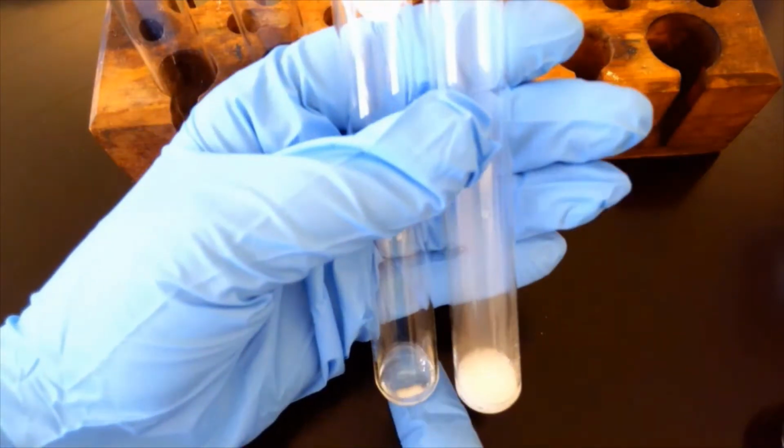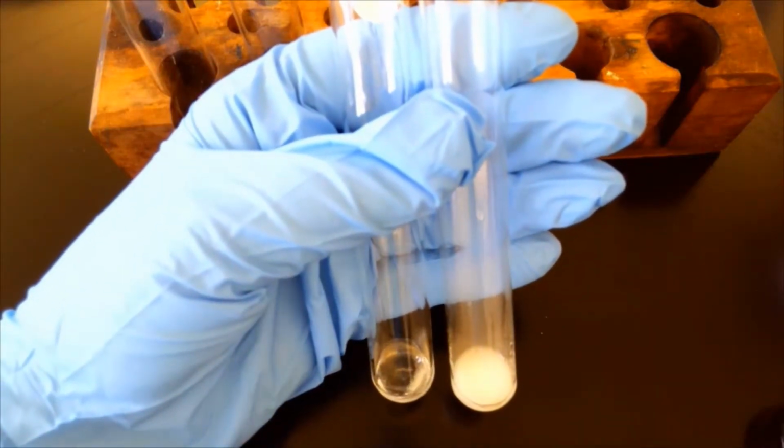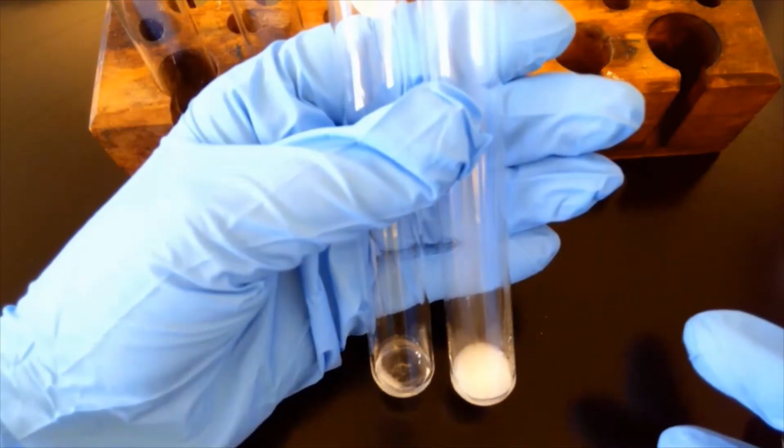Same with the acetic acid, not so much. I can keep my finger on here longer, but right now I can only, that actually hurt. You can only touch it for a little bit before it actually gets really hot.